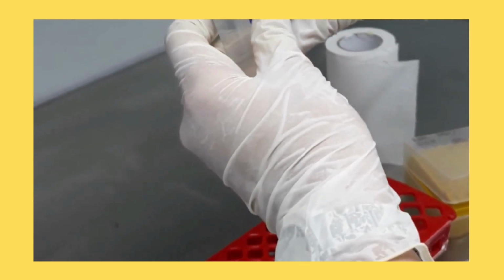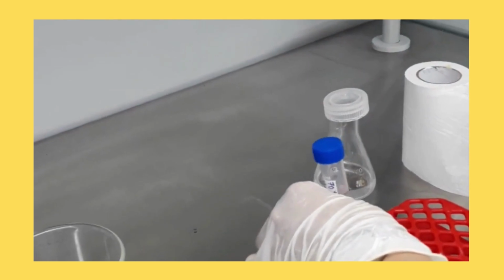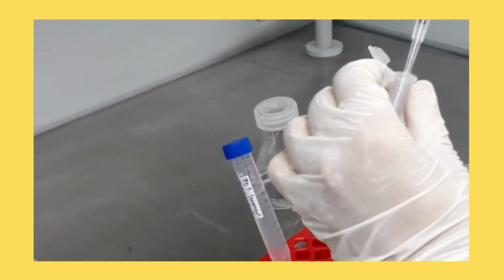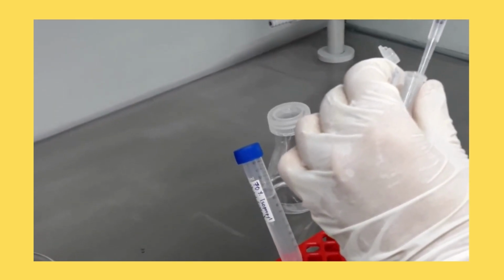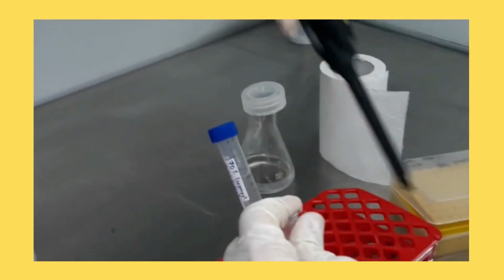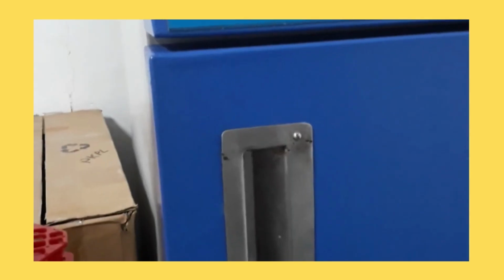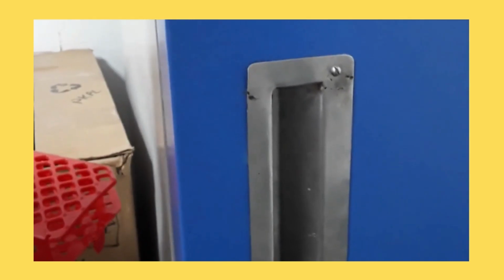Now comes the total RNA precipitation. Here we have to add an equal volume of isopropanol as per the aqueous phase used and mix gently by inverting the tube. Now incubate the tube for 2 hours at minus 20 degrees Celsius.